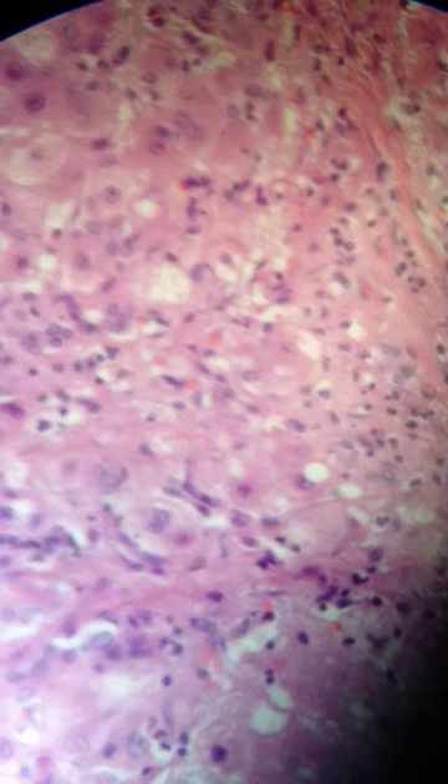Let's go to 40x. Well, that's 40x. Wow. It's not quite as good as a scan at scale. Now the focus becomes tough, right? You have to keep focusing as you're moving it around.